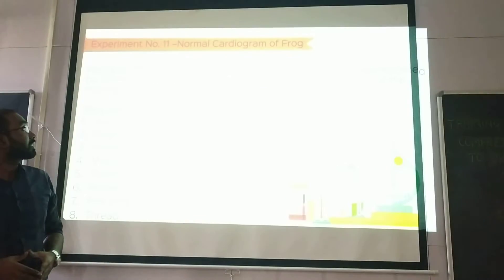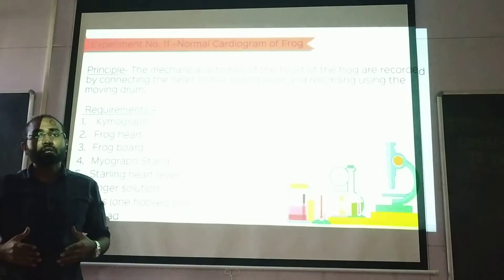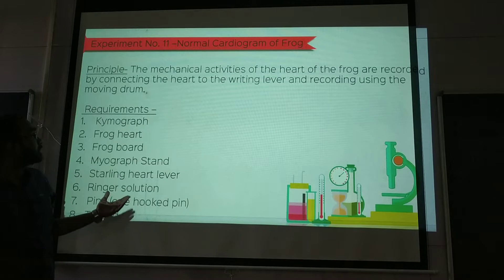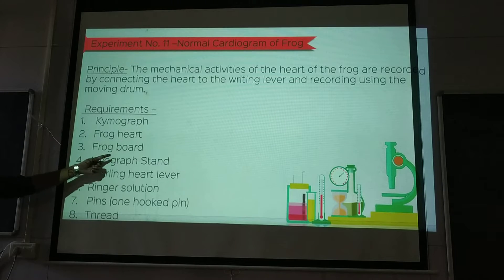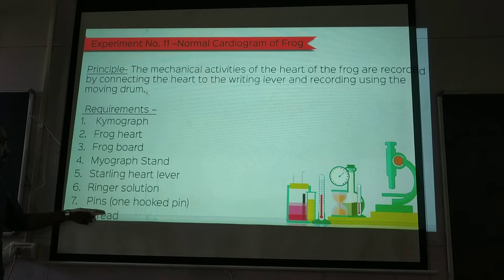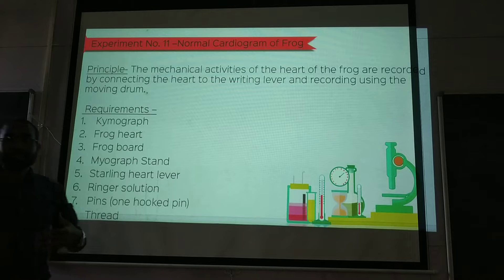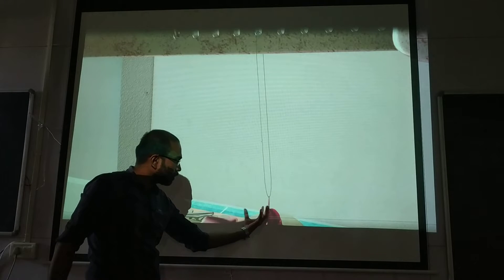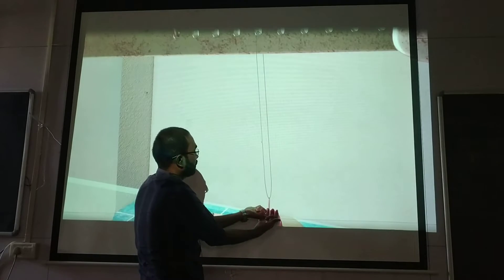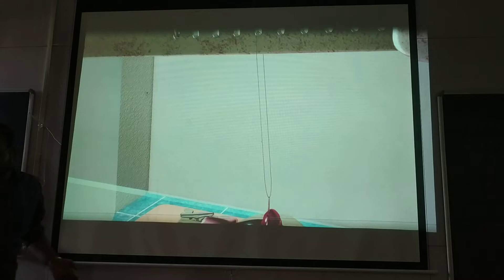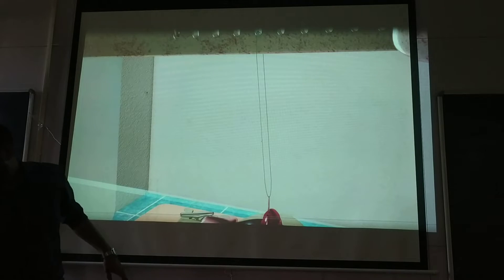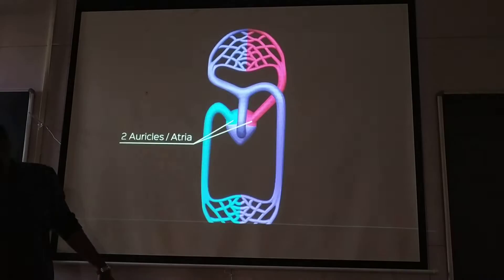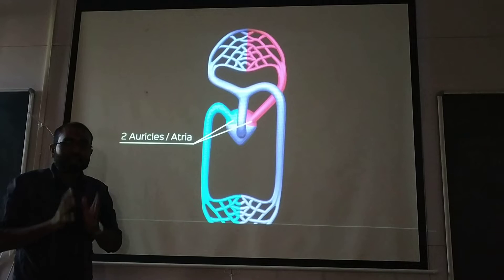Welcome back. In this video we'll be discussing the normal cardiogram of frog — how a normal frog cardiogram looks. The things we require here are a kymograph, a frog's heart, frog board, myograph stand, Starling's heart lever, Ringer's solution, pins, and thread. This is how we take the recording — the frog's heart, like this.